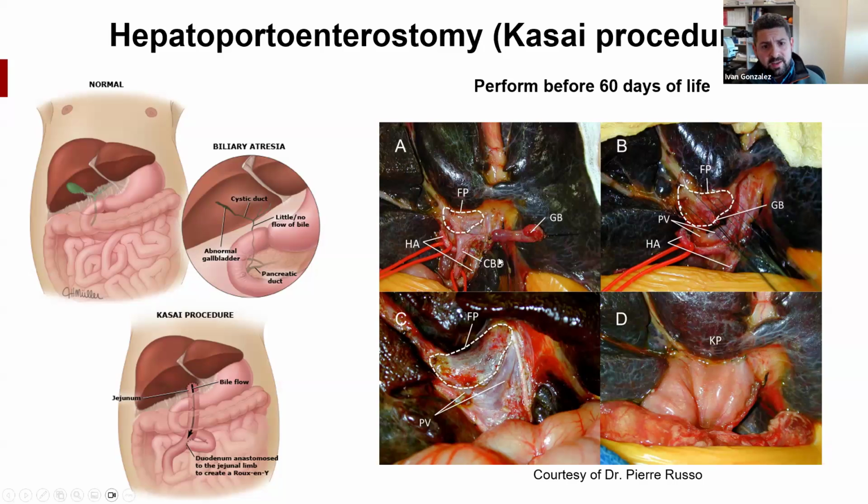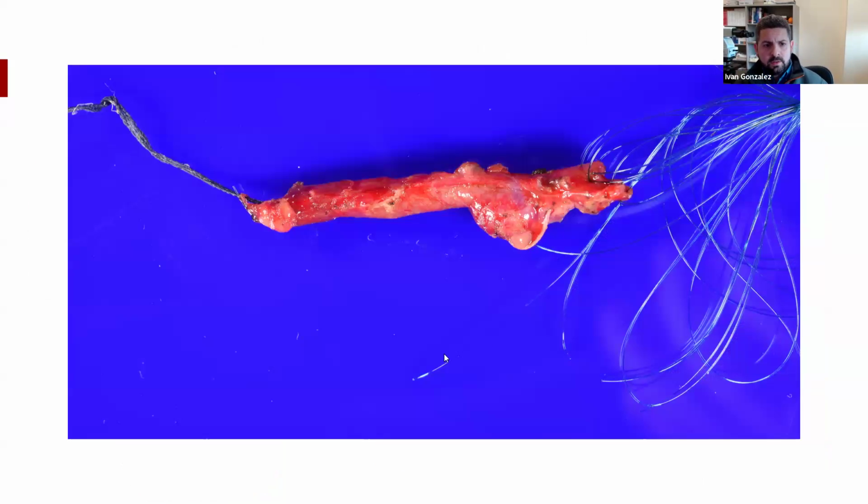So when you're doing the Kasai, you find your fibrous plate, and the surgeon will apply all these sutures and basically lift the fibrous plate and then cut underneath or proximal to it. And then at that point, they will attach your small intestine, creating that hepatoportal enterostomy. So your specimen on the gross bench, you can see a lot of these sutures; that will be their fibrous plate. The surgeon usually will orient it for you, but even if they don't tell you, when you see multiple of those sutures, that will be your fibrous plate.